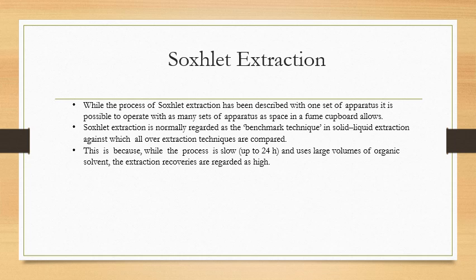While the process of Soxhlet extraction has been described with one set of apparatus, it is possible to operate with as many sets of apparatus as the space in a fume cupboard allows.